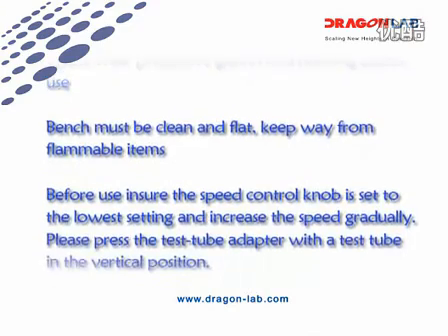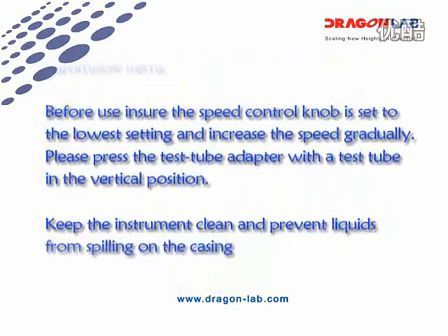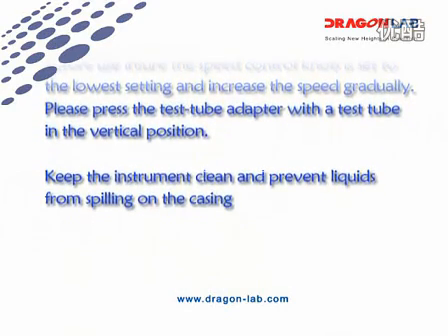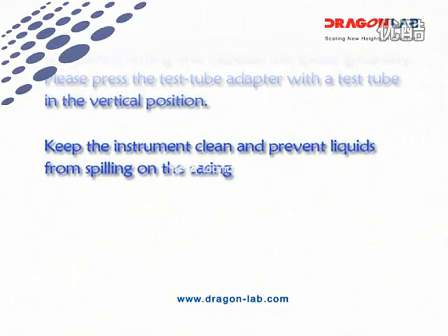Before use, ensure the speed control knob is set to the lowest setting and increase the speed gradually. Press the test tube adapter with the test tube in the vertical position. Keep the instrument clean and prevent liquid from spilling on the casing.